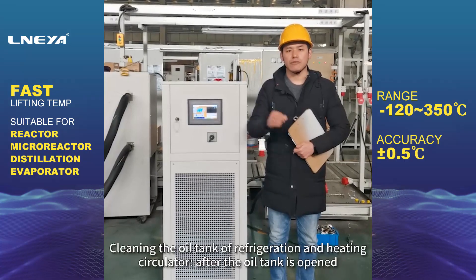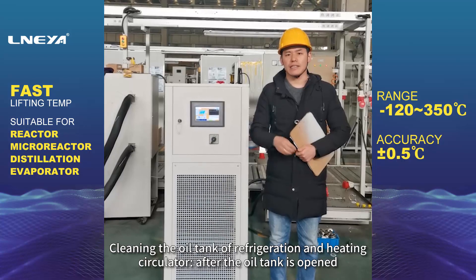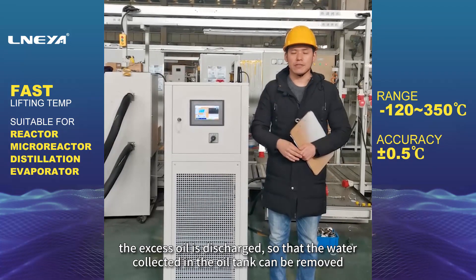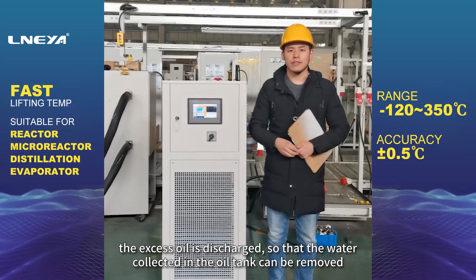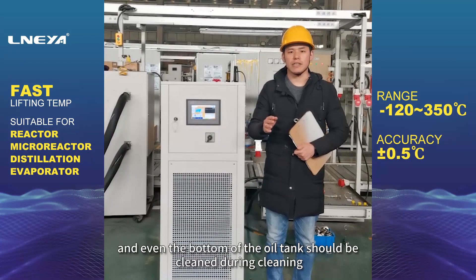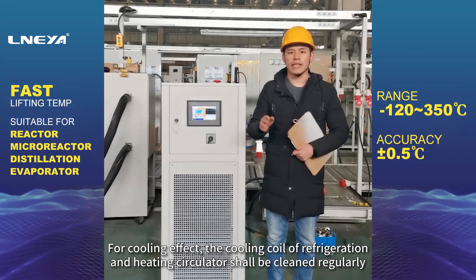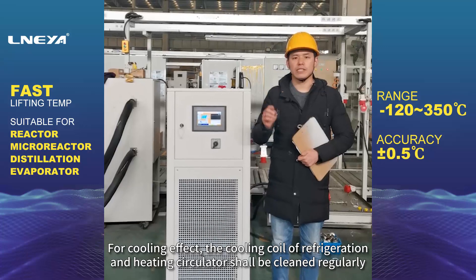Cleaning the oil tank of the refrigeration and heating circulator: after the oil tank is opened, the excess oil is discharged so that the water collected in the oil tank can be removed. Even the bottom of the oil tank should be cleaned during cleaning.